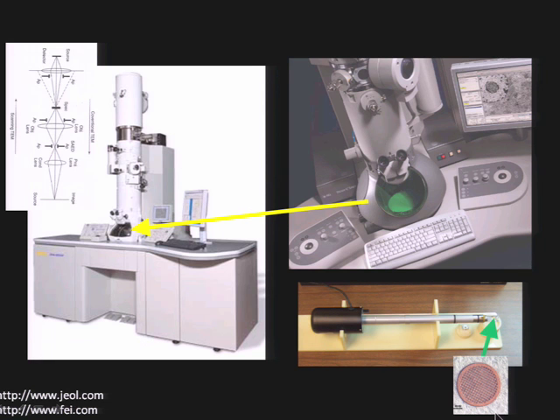So you typically do this on what's called a TEM grid, and typical TEM grids are 3 millimeters in diameter, so that's already pretty small. But what you need to put in there is much smaller and across a little gap, as we'll see in a minute. But this grid goes into what's called a sample holder, which is like this post like so.